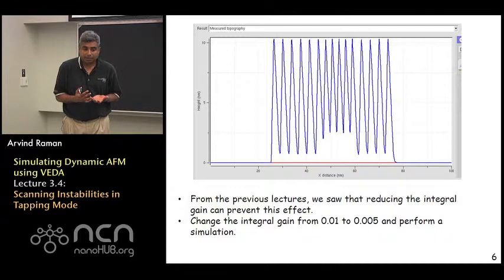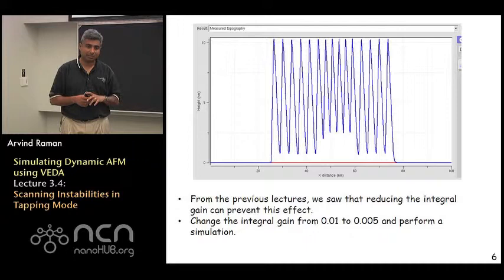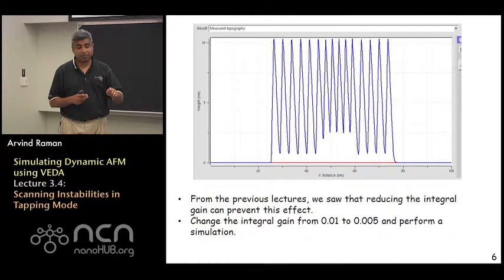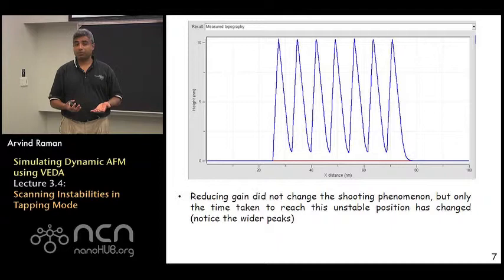So the first response when one sees this is that perhaps you have chosen a very large integral gain. Because we have shown before that if the integral gain becomes very large, you can get these oscillatory kind of instabilities. So the first thought is, well, this must be because we got too high an integral gain, so you may want to reduce the integral gain a little bit. If you do that and repeat the simulation and see what kind of height profile you get, you find that lo and behold, you have not improved the situation.